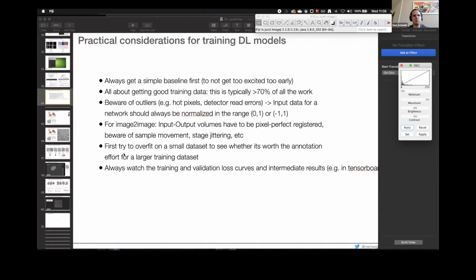Starting with some imperfect annotation, cleaning it up, training, cleaning up again, and iterating on that could be an effective way to get high quality annotations.